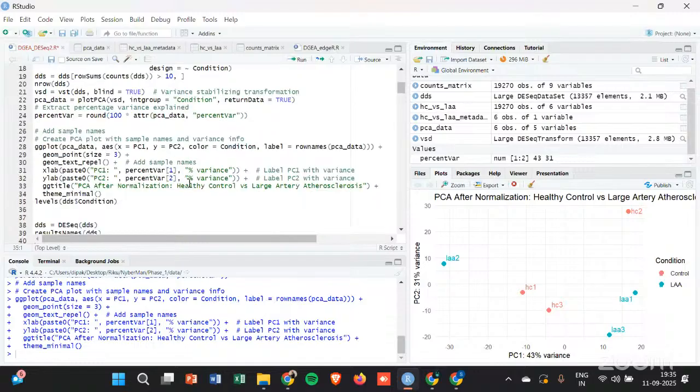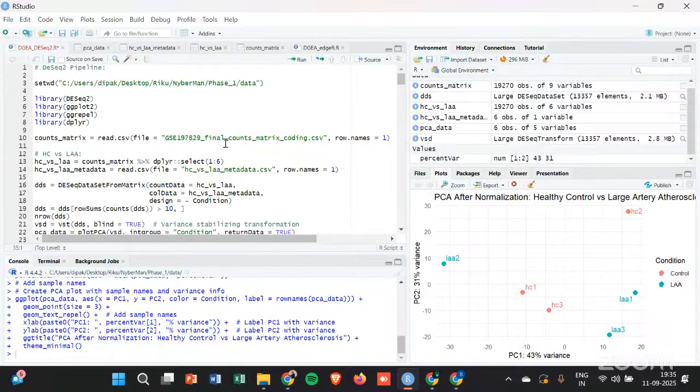Okay. So from this RNA script, we will delete that data, not from the beginning? No, no, no. So you won't delete it from your file. Your file still remains the same. In the script, you are doing your deletion. Yes, yeah.